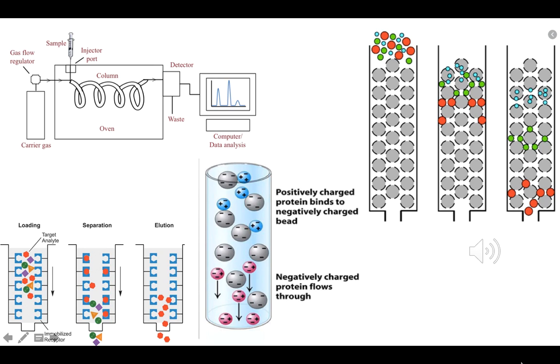The last two chromatography techniques we're talking about are gas chromatography and chiral column chromatography. Gas-liquid chromatography works on highly volatile compounds and separates based on boiling point and polarity. The more volatile your compound, meaning the lower the boiling point, the sooner it will elute. It will fly right through the gas chromatograph and elute first. The higher boiling point compound will get stuck and come later on.